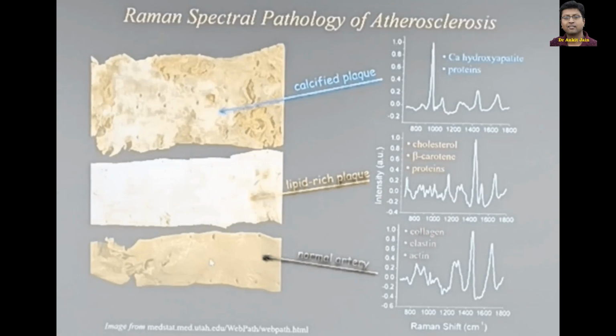When you go to archaeological museums and you want to study why there was a certain kind of genocide in olden times at a particular location, they carry out Raman spectroscopy because they don't want to damage the bones, but they want to find out the reasons for the mass genocide or destruction of certain kinds of archaeological mummies and so on.